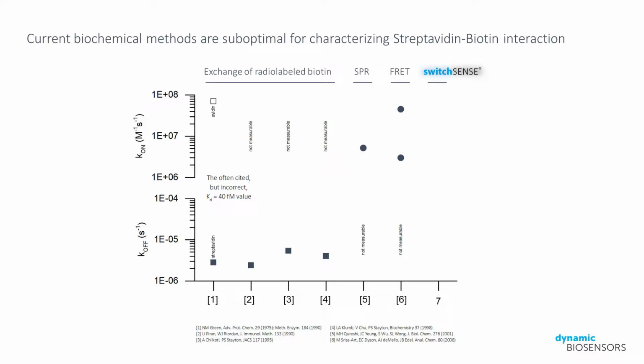With our switchSENSE technology, however, we can easily and reproducibly resolve both, and as a result, the correct dissociation constant can be determined in a single measurement.